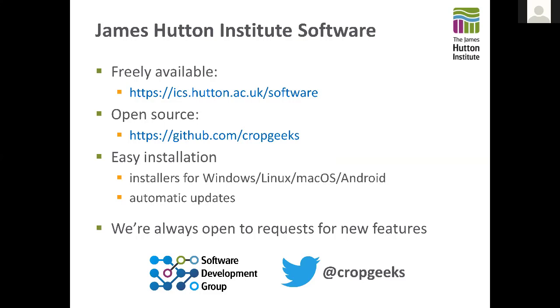And what are the inputs, Gordon? Is that an allele matrix, or do you have to do the PCA analysis before going into CurlyWurly? You do the PCA analysis before going into CurlyWurly. The data format is explained on our documentation website.